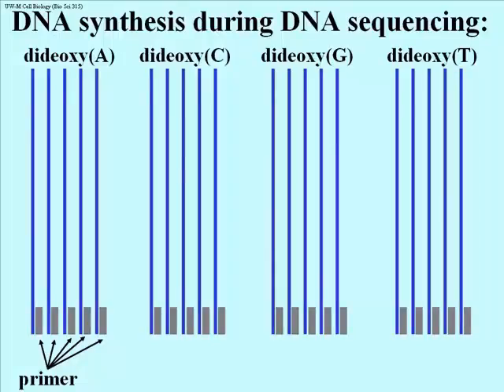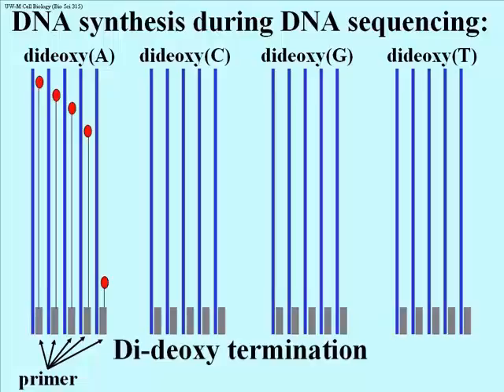As DNA is synthesized, if you have put the right proportions of ingredients into these tubes, every now and then a dideoxy-A is going to be added to the end of a growing chain, and at that point, that chain cannot grow any further. So the idea is that we will have made, on a random basis, several different length new molecules of DNA, each one extended until the incorporation of one of these dideoxy-A molecules. At that point, they can't grow anymore. So we have a distribution of different fragments within a dideoxy-A opposite a T in the template.